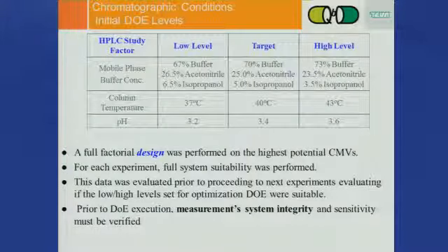So this is the DOE. A full factorial DOE was used. There's 2 to the n. In this particular case, there's 3 variables, so 2 raised to the power of 3 equals 8 experiments. Typically, you don't just do the 8 experiments. You also need to do replicates. You need to ensure from your replicate analysis what's the normal variability of your method.